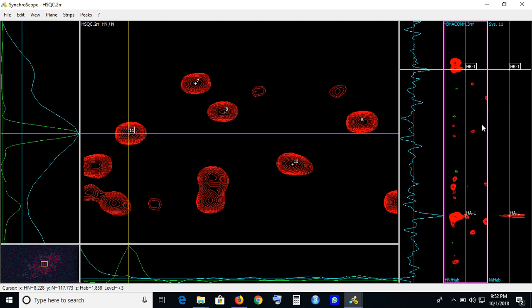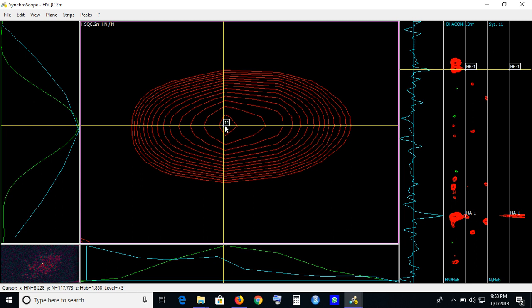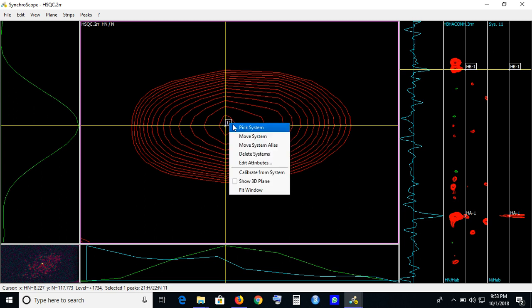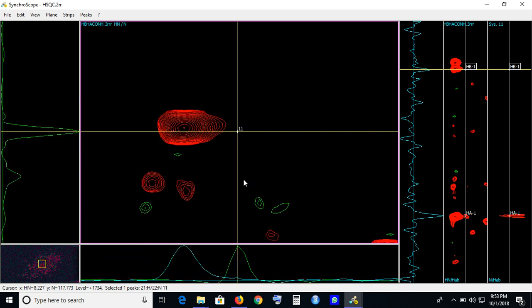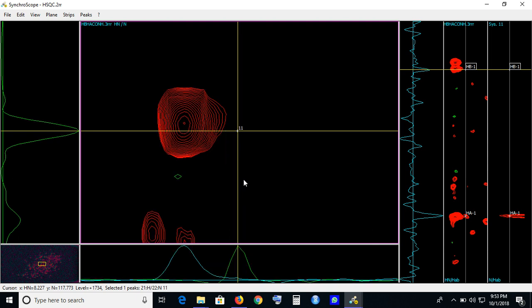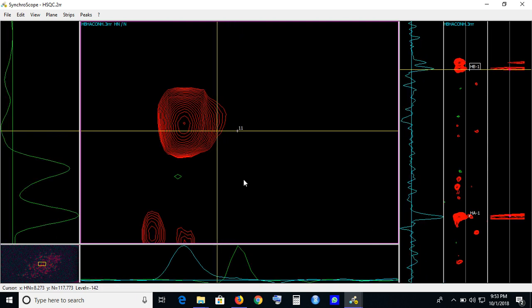So the other two panels in the side are actually the 3D plane for a peak. So this is 2D contour, and if you imagine a vertical line, that will be this one. Okay, now zoom the spectrum, zoom the particular peak, center it properly. Now go to the show 3D plane option by right clicking on that. So your peak center in the 3D plane will be somewhere different. Adjust it.